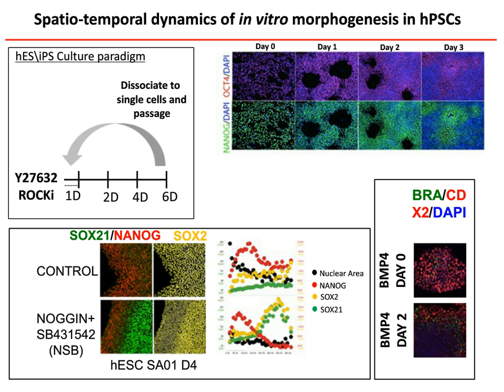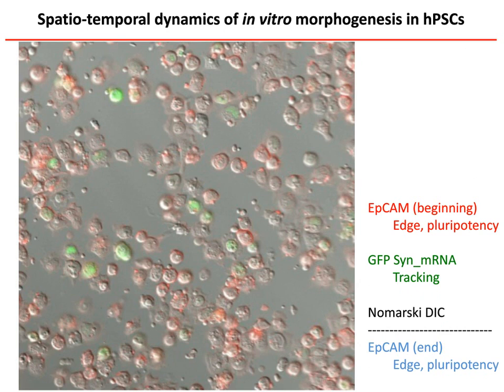So I'll show a short movie that demonstrates the self-organizing properties of pluripotent cells. In this movie, the images are updated every 2 minutes across a period of 2 days. In the first image, you'll see cells landing right after passage. So this is acutely after passage.